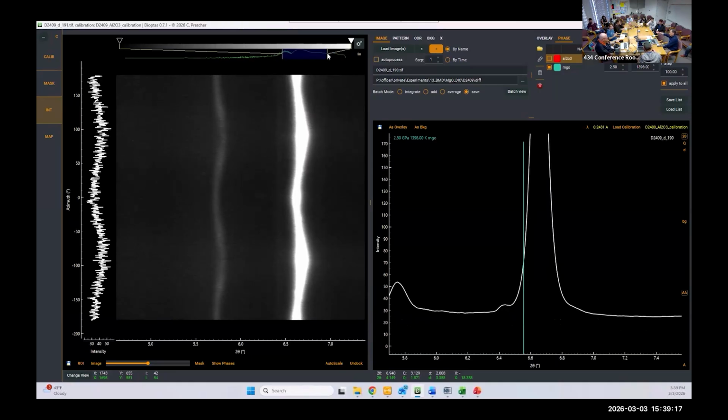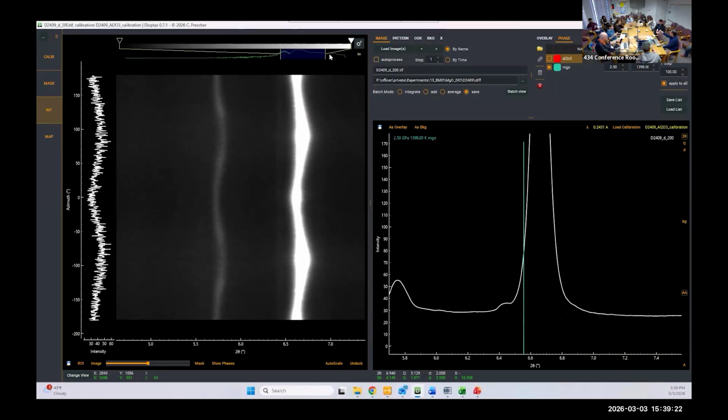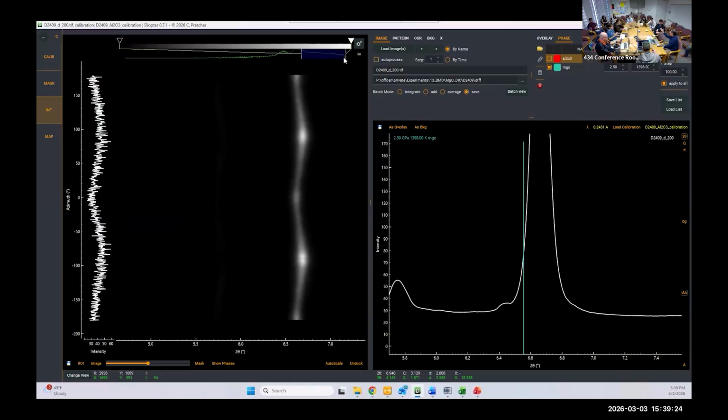The other useful aspect is if you have a low symmetry sample you want to study, you want to know which peak you're going to focus on. For example, there's a lot of peak overlap, and there may be only one peak that's not overlapping. You want to focus on that one. So you can use this to say, okay, if I apply pressure to 5 GPa, will this peak move out of my range? Then I need to select a different photon energy to move it into the range so I can collect the right data. So it's very useful for this.